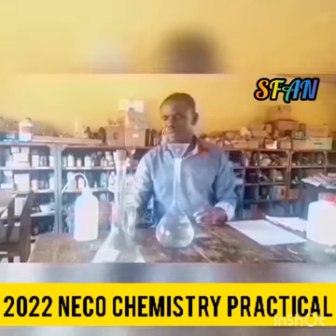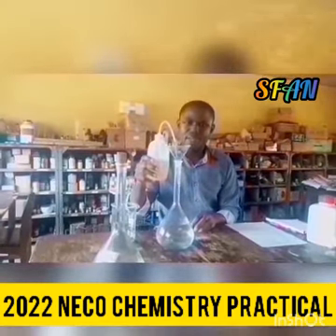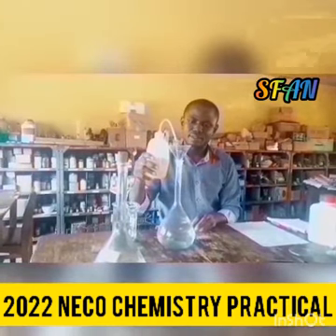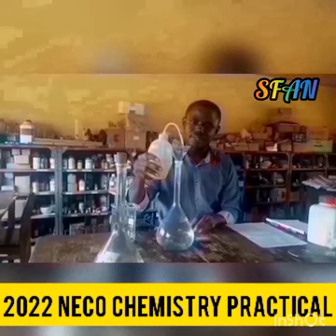Okay, then I'll top it up to the 1000 cm³ mark with distilled water.